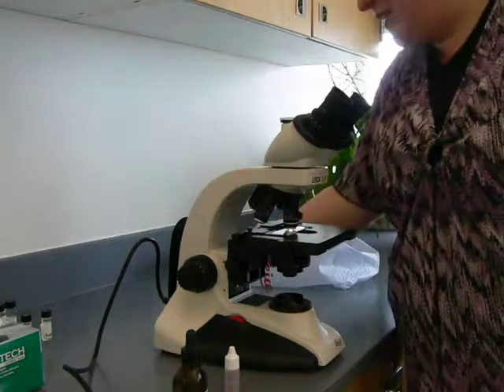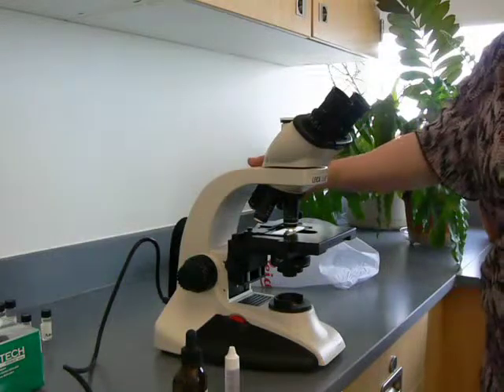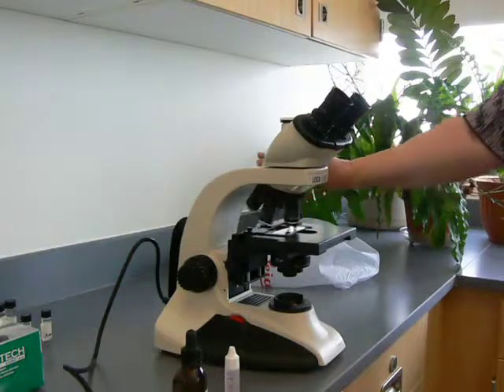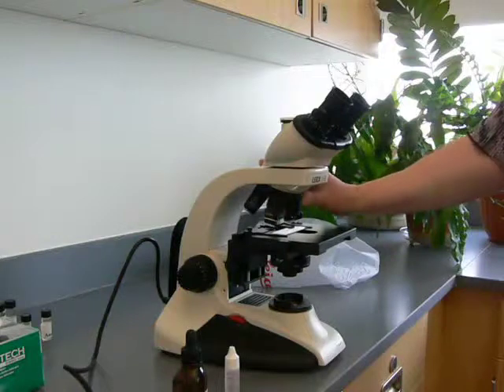Now, while I've got your attention, let's talk about how to clean the objective from the oil. You always want to go back toward the 4X. Do not go back around to your 40X. We try to keep the oil off the 40X if at all possible.